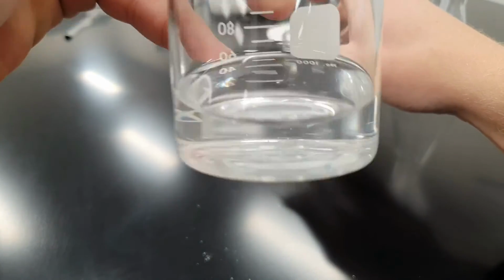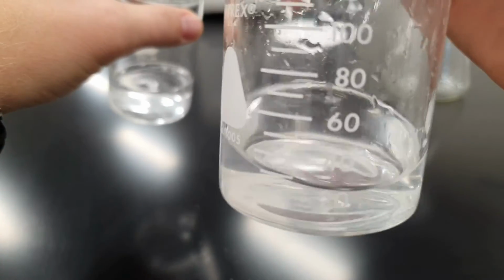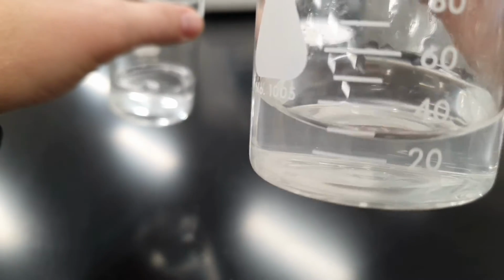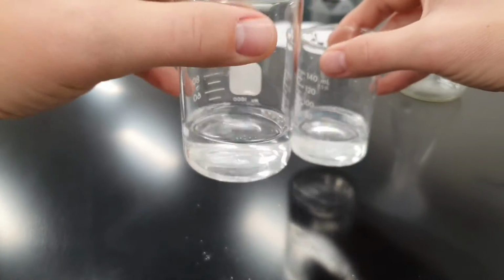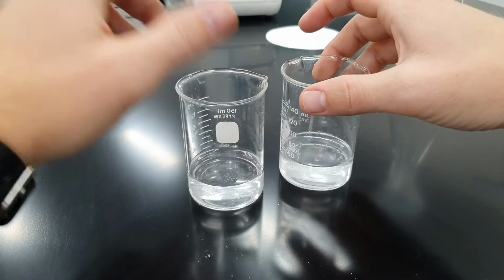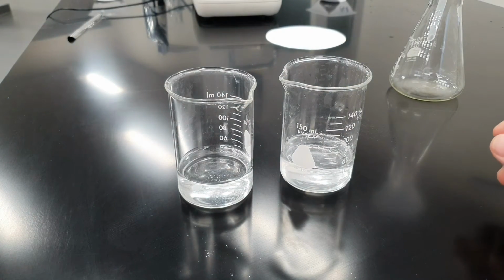So here was our sodium carbonate, and here was our calcium chloride solution. And if you look in there, you can tell, hey, it's clear. It's not cloudy anymore. We don't see any more solid left at the bottom there. So those have gone ahead and dissolved. All right, so if we're following along with our lab, our next step is going to be to mix these two solutions together and see what happens.